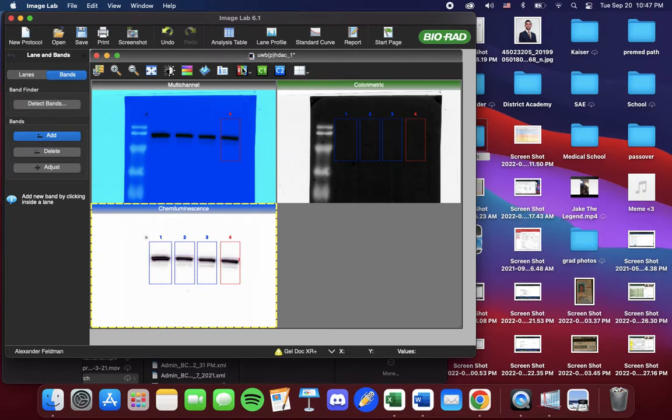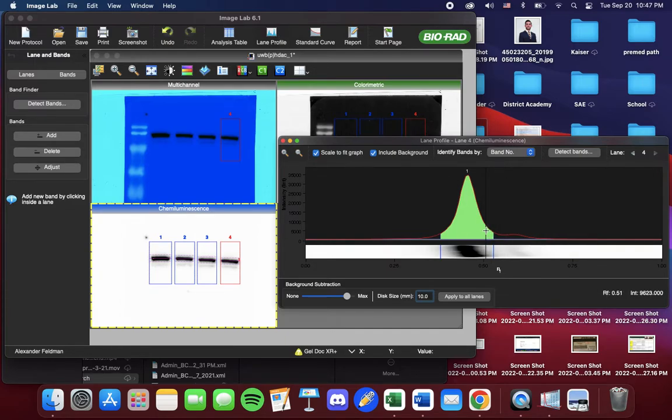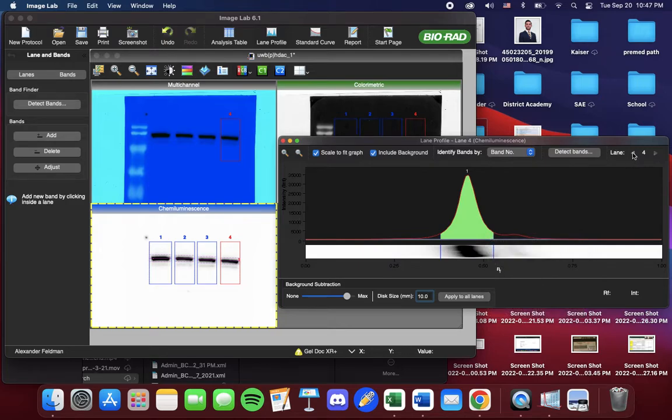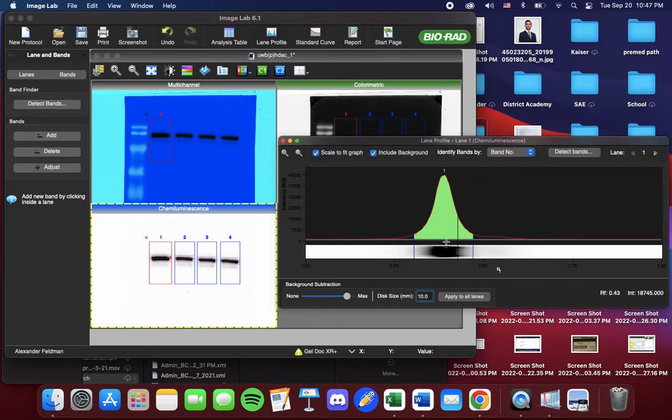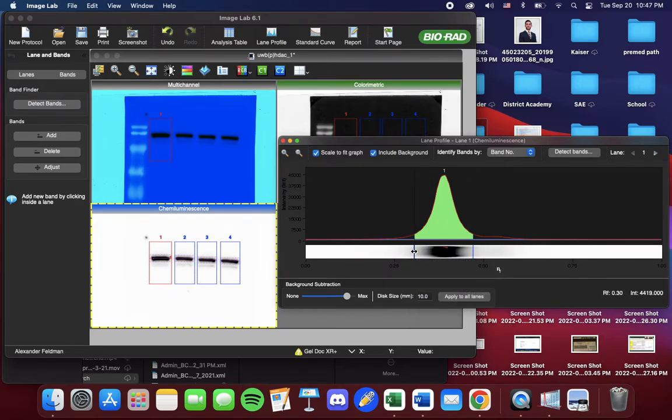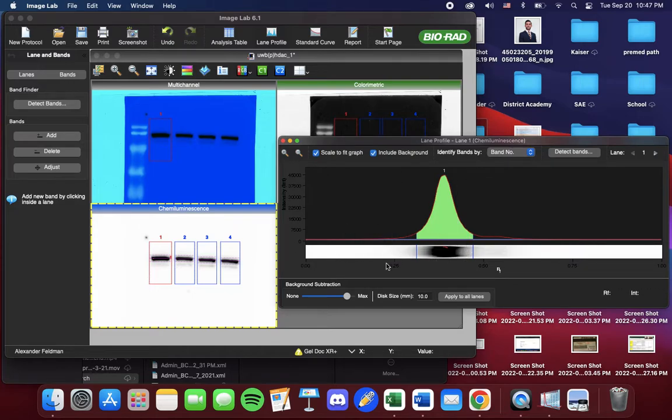Now if you want to adjust the range of band detection, you would go up to Lane Profile. From Lane Profile, we can focus on different lanes. So we'll start off at Lane 1. And we can move these parameters to include or not include areas. But I'm going to keep it as is.